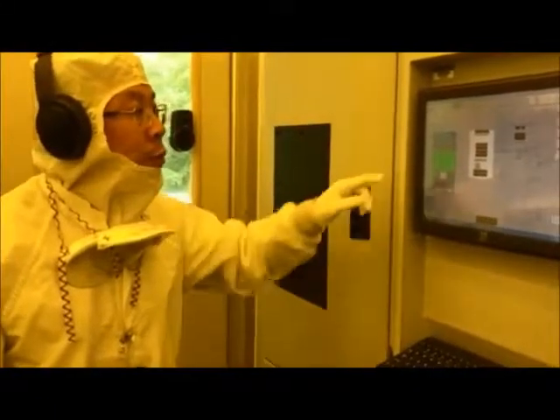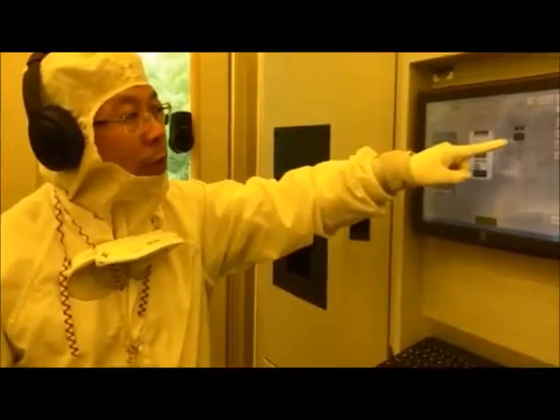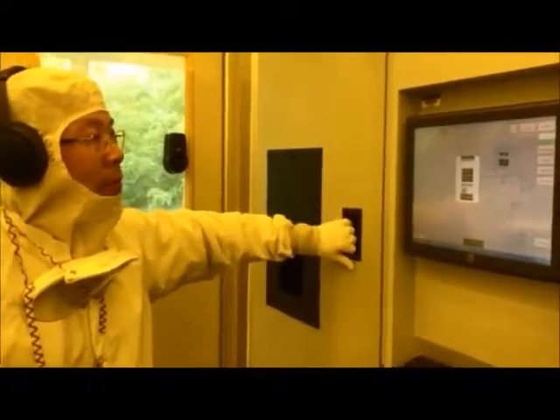After 15 minutes, you should see the PC1 complete. You should see the turbo speed is at 0%. Then you can open the chamber.